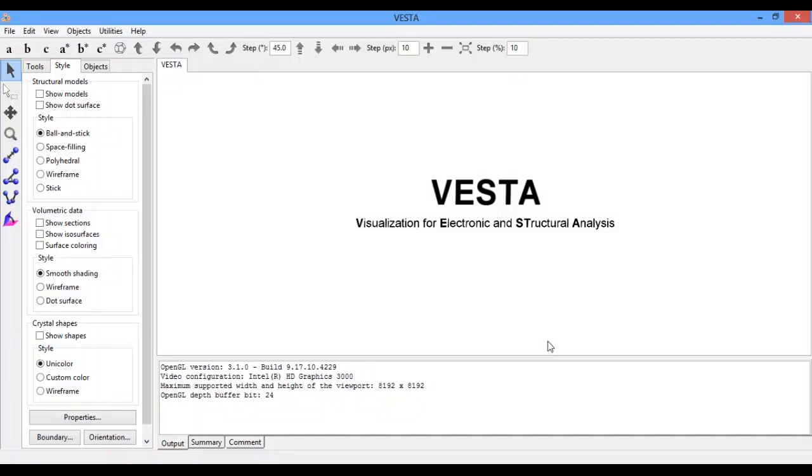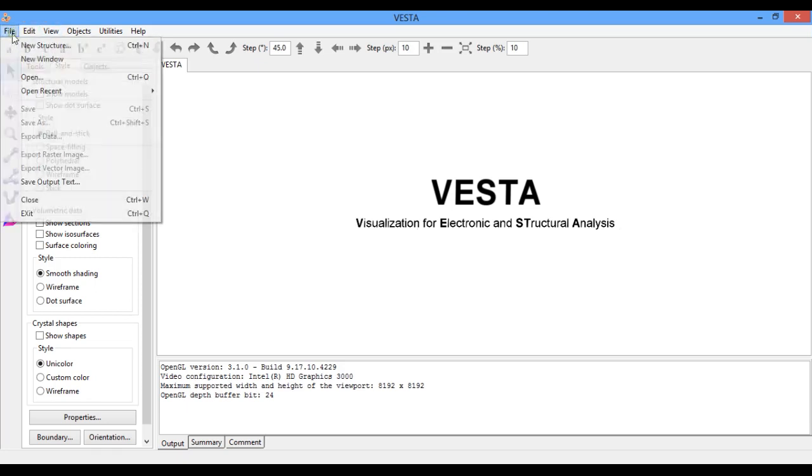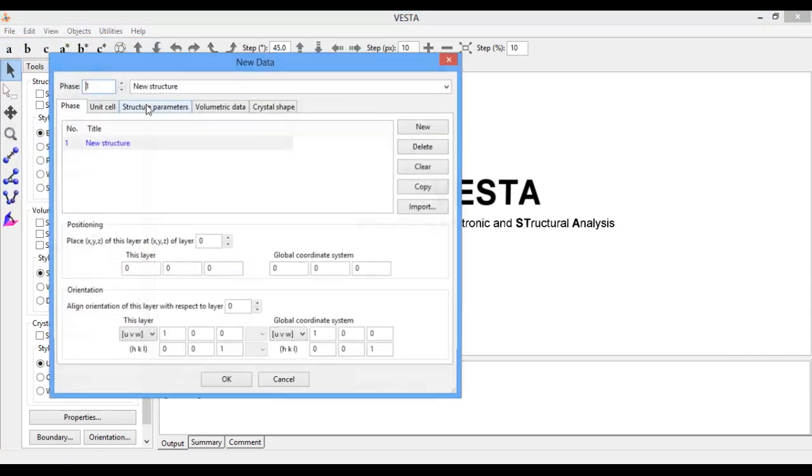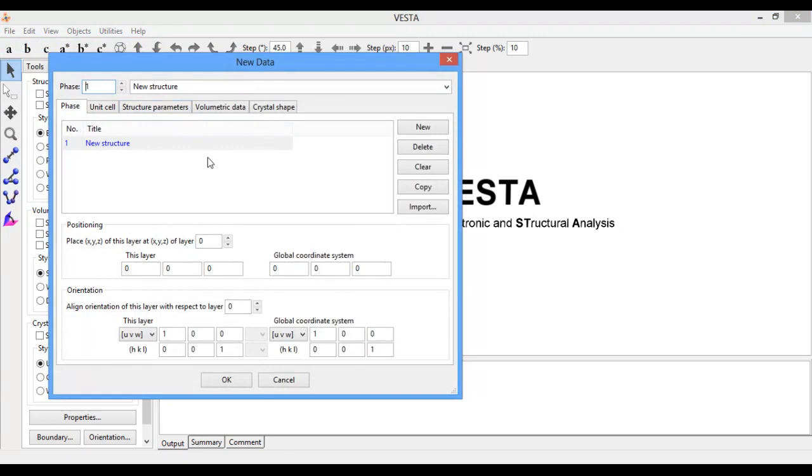Hello everyone, in today's tutorial I will show you how to draw crystal structure with VESTA. I will draw the crystal structure of titanium carbide. Let's begin. Go to File, click on New Structure, and name it as TiC.